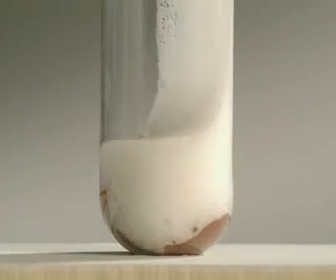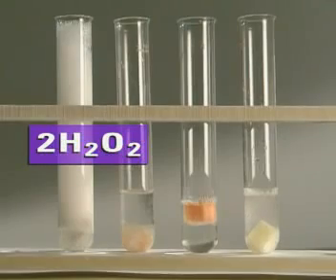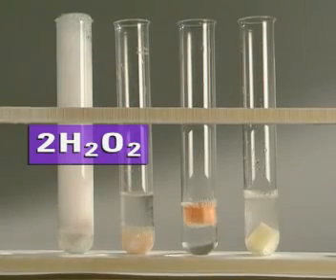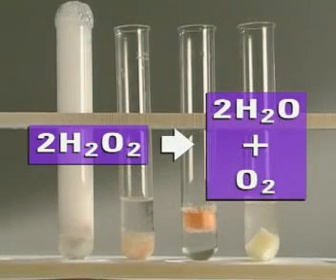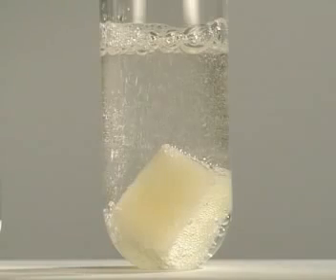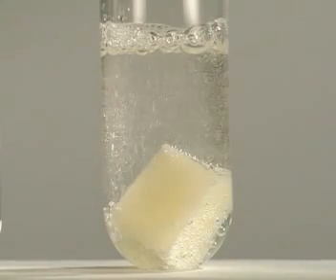Add hydrogen peroxide solution and it begins to fizz. Catalase in the tissues breaks down hydrogen peroxide into water and oxygen. The oxygen escapes as a gas. Potato is rich in catalase.